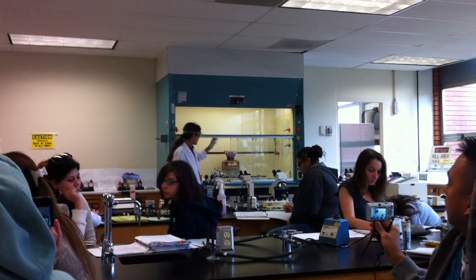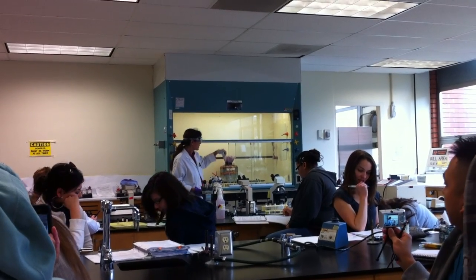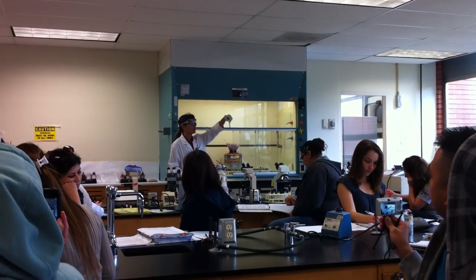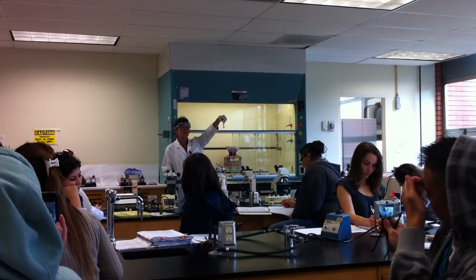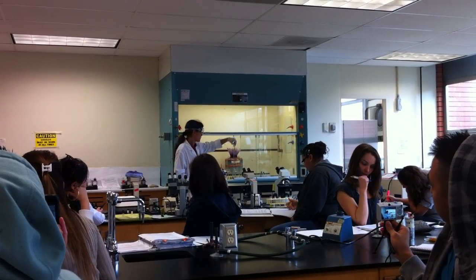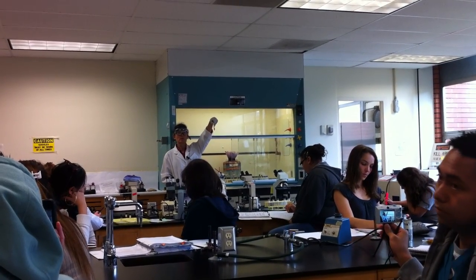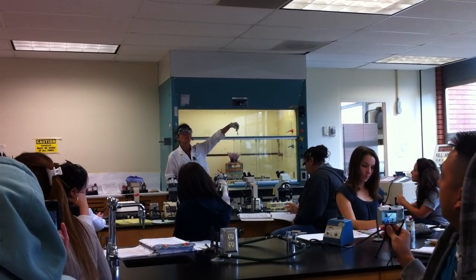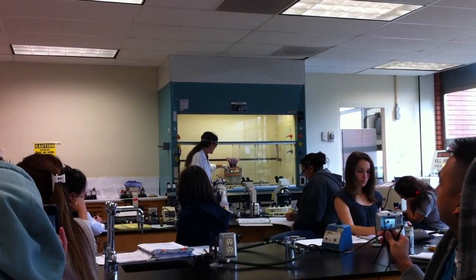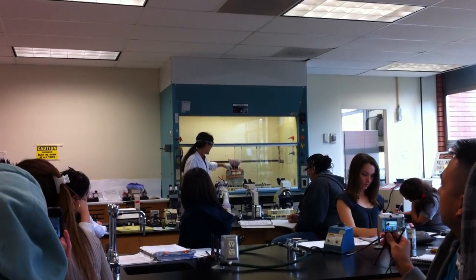Okay. Now, so let's say it's been an hour, you guys. Here's another tube. Is this VP positive or negative? Negative. Okay, good. So what does that tell you about your organism? It doesn't carry out butylene glycol fermentation. Good. All right. So of your E. coli and Enterobacter aerogenes, who would this be? You would predict E. coli. Good. And who would this be? Enterobacter aerogenes. Dynamite.